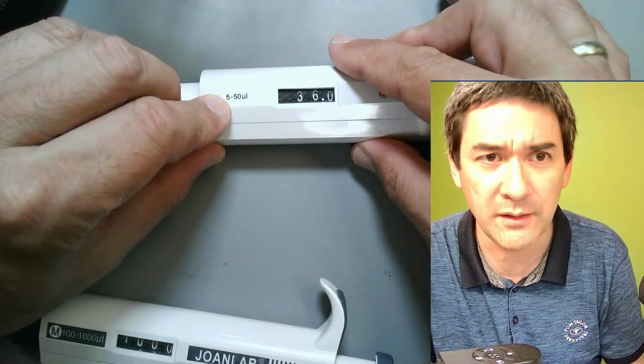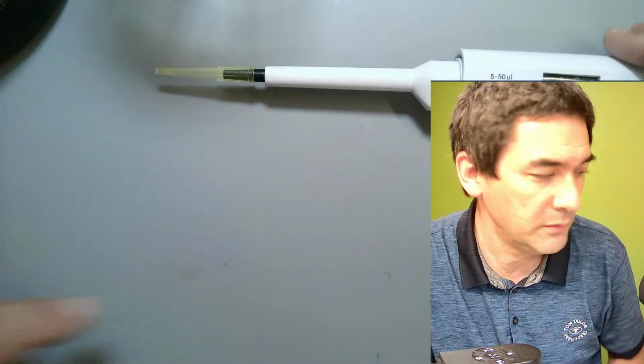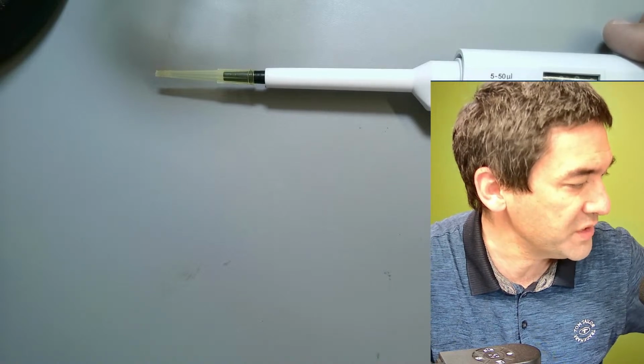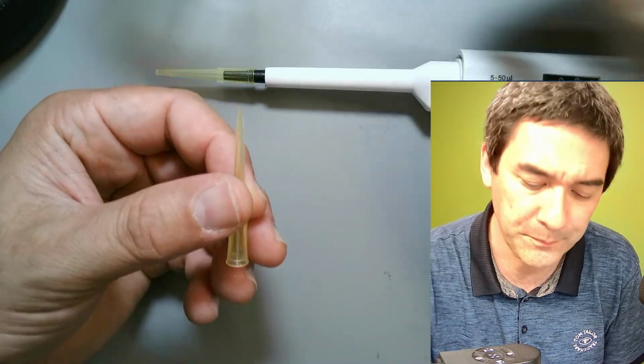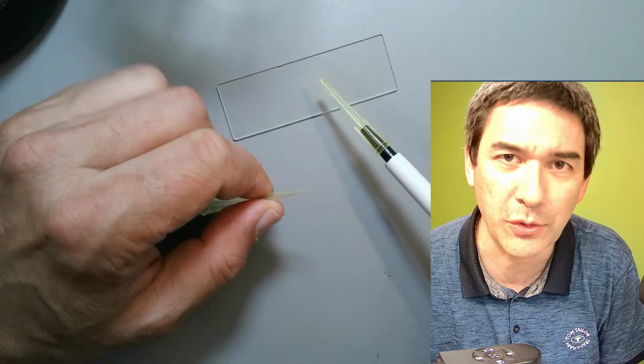The reason I like this one is because the tips are much smaller, small enough that I'm able to pick up individual organisms from a slide under the microscope.